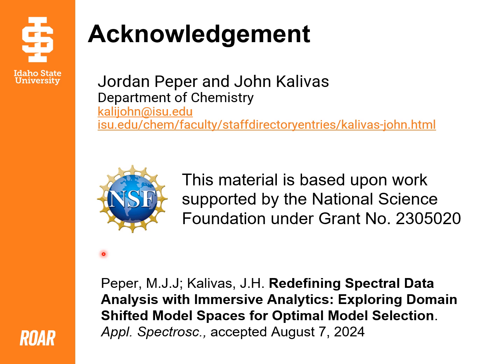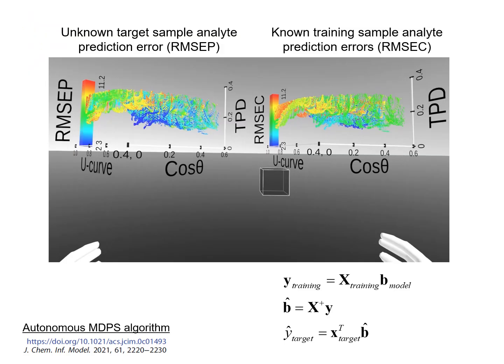And our approach is to select a collection of models that have model diversity, and yet they predict our analyte concentration, typically, is what we work with, the same as we'll see. All right, so this is what we'll see in our VR at the beginning of the movie. And we have two landscapes for all the models. And on the right here are the prediction errors, color coded, to our training samples.